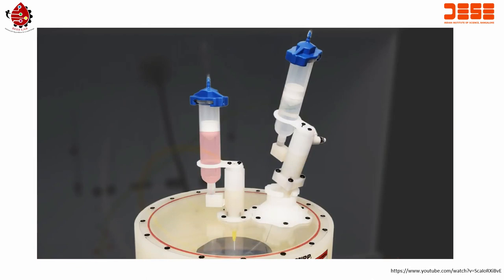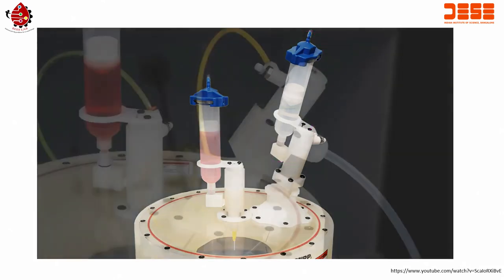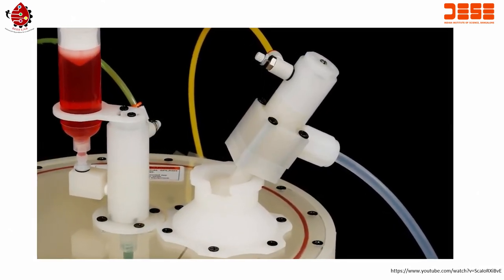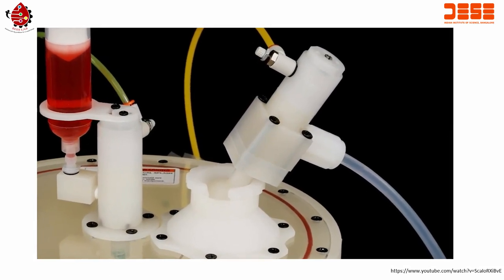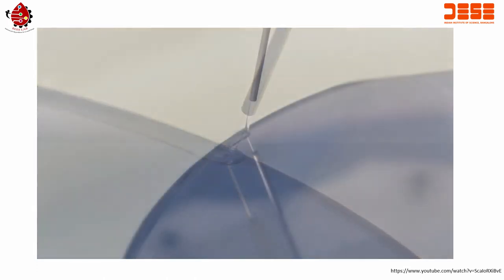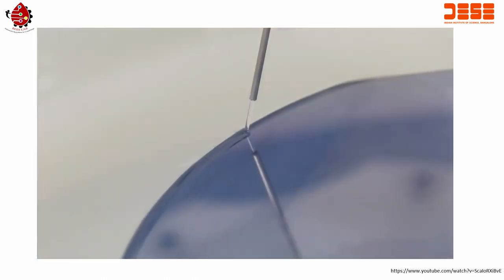The UD3B we are using has the solvent fed by an air-operated syringe. There are options available that allow solvent to be fed from a pressure vessel or from a bottle through a bottle pump. A fine needle is used, and in combination with a low syringe dispense pressure, this creates a consistent stream of solvent that can be accurately directed at the edge of the substrate.